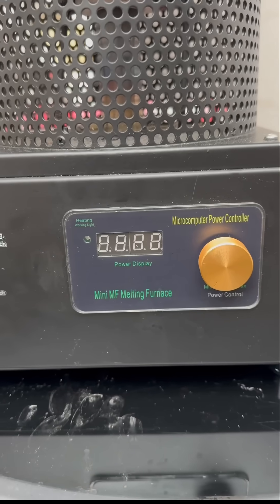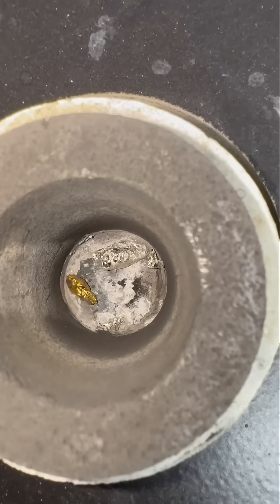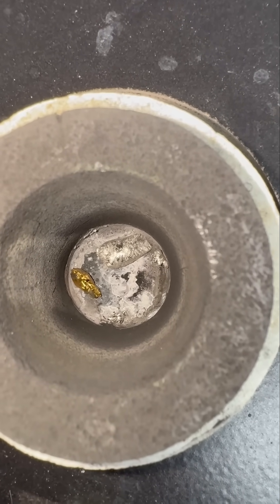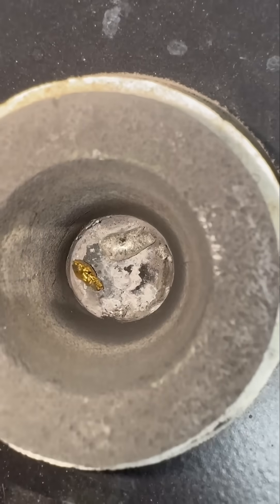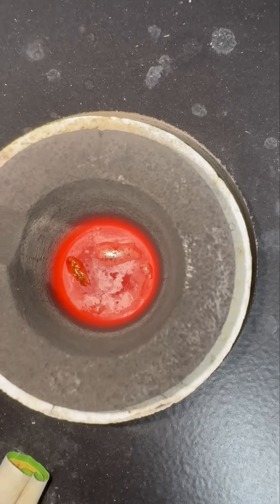We set it to the blue gold settings, bust on the power, and increase the temperature. Gallium's melting point is very low at only 30 degrees Celsius, but gold's is very high at 1000 degrees — that's why the gallium melted quickly but the gold is taking longer.